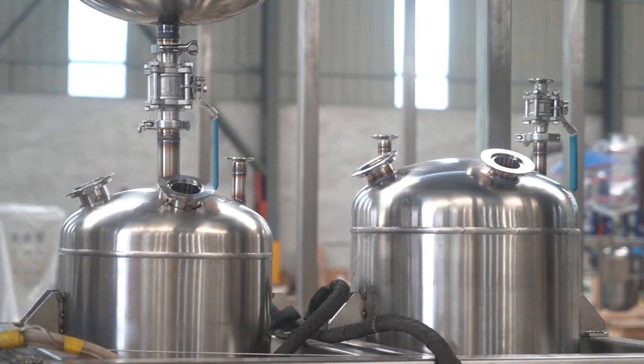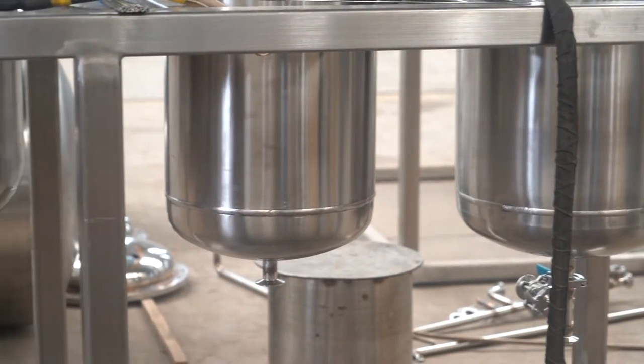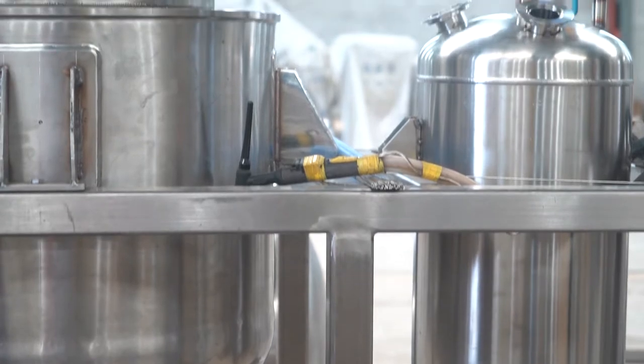For this system, we customise the mother liquid recovery function. This one is to recover your mother liquid solvent.